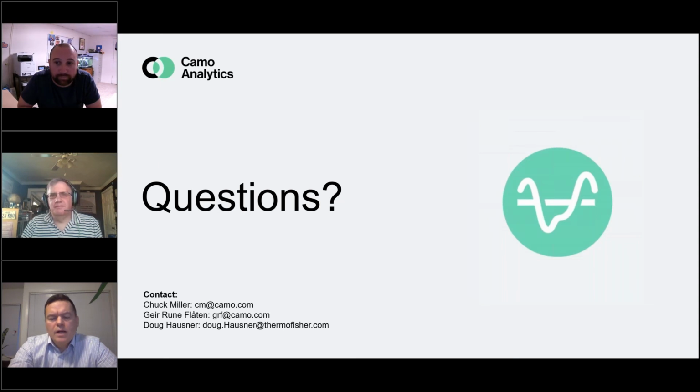Yeah. And in the extension of that, Doug, we have got a question here which might be a continuation of that thinking. The question is, what are your views on how we can maximize the value from PAT for reaction monitoring in R&D, where numbers of experiments will be limited, but typically run with design variation to develop a process?